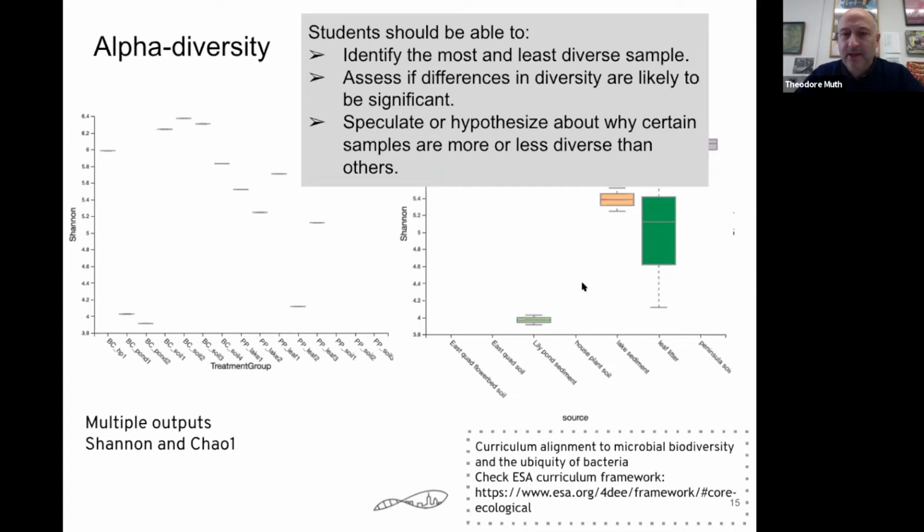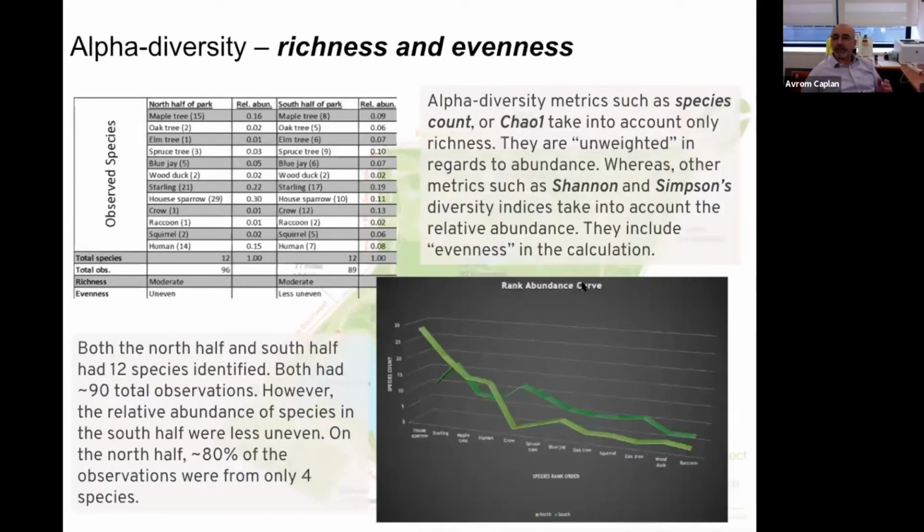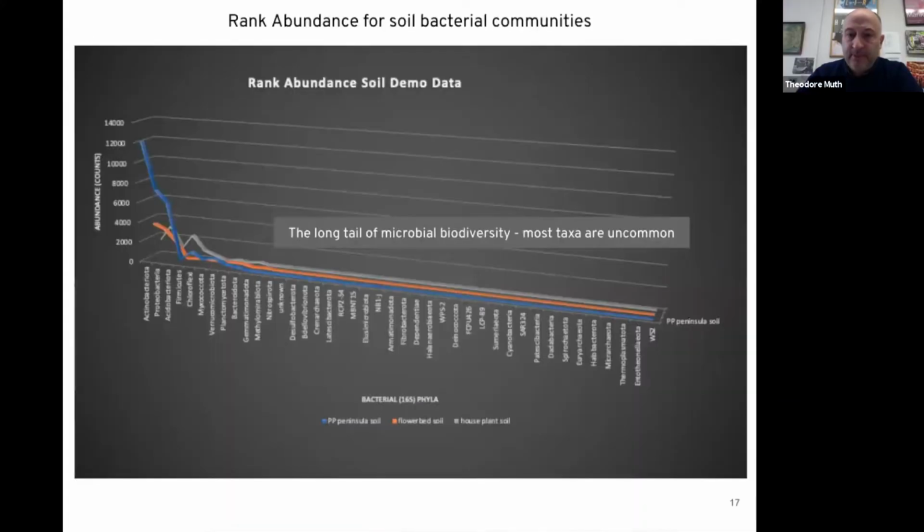Okay. So Karen Thickman asks about contaminants and low abundance ones. Contaminants or not, how can you tell the difference? Excellent question. If you watch the video, I mentioned this a little bit, but notice here that firmicutes is high in the houseplant soil, and it's not very high in any of the other soils.